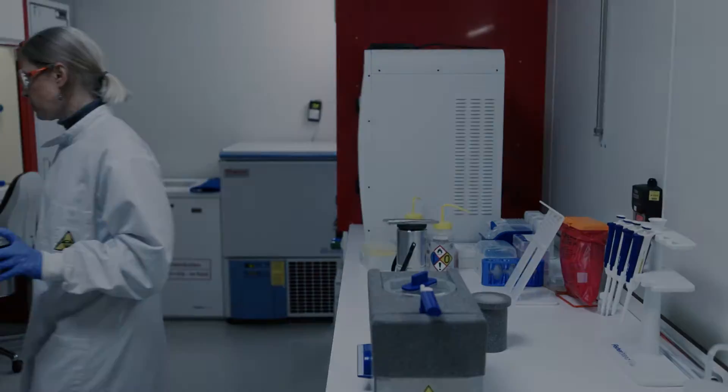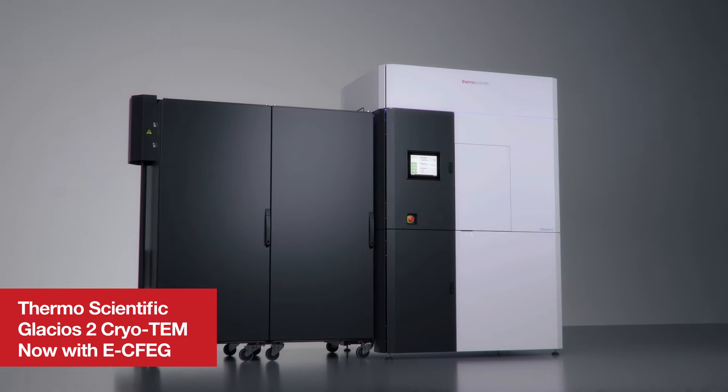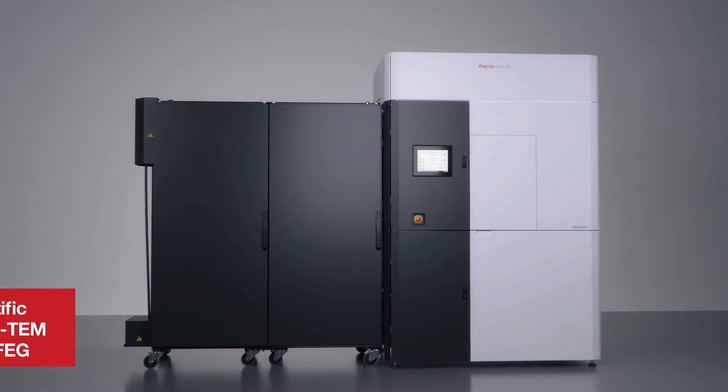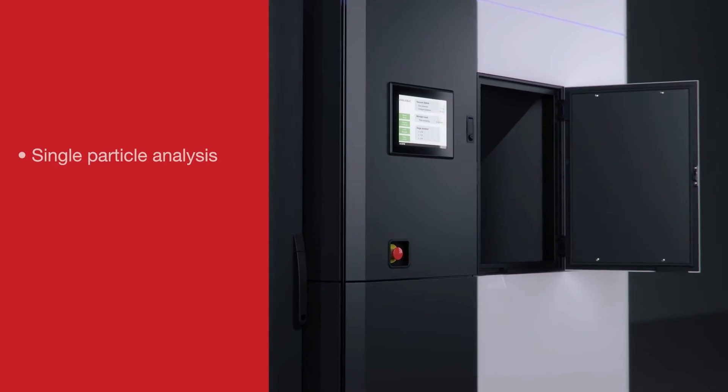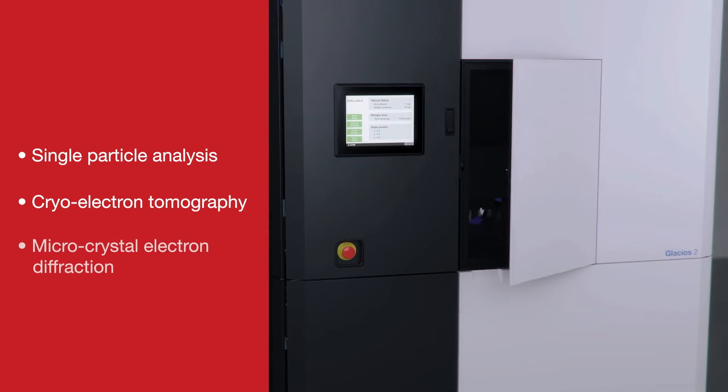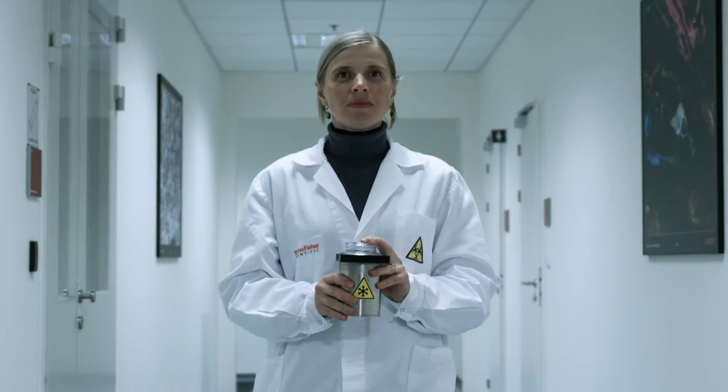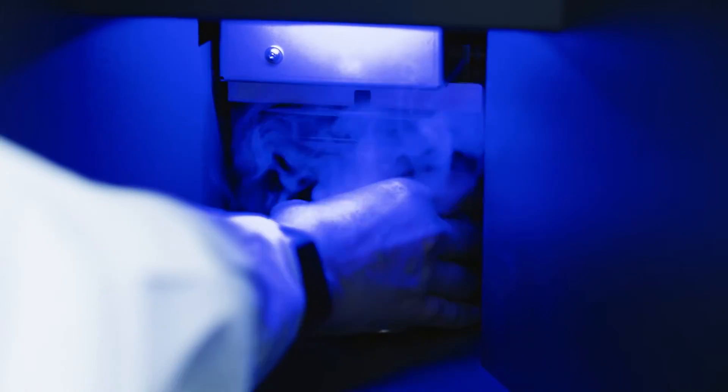That's why we made the Thermoscientific Glacios II CryoTEM, a capable, next-generation cryo-transmission electron microscope. Ideal for single particle analysis, cryoelectron tomography, and microcrystal electron diffraction, this flexible 200-kilovolt autoloader instrument can produce high-resolution structural data on nanoscale biological targets.